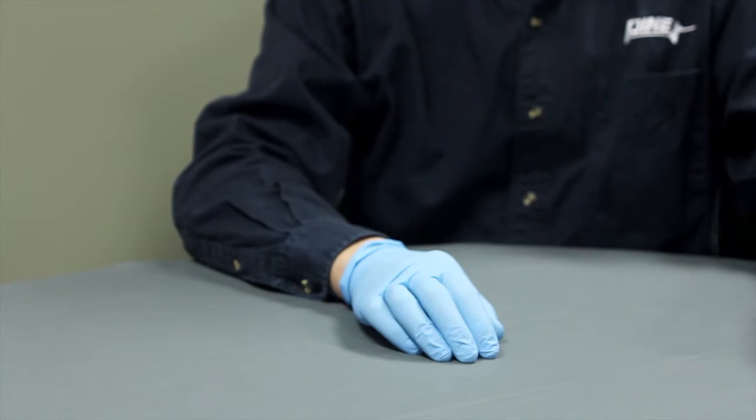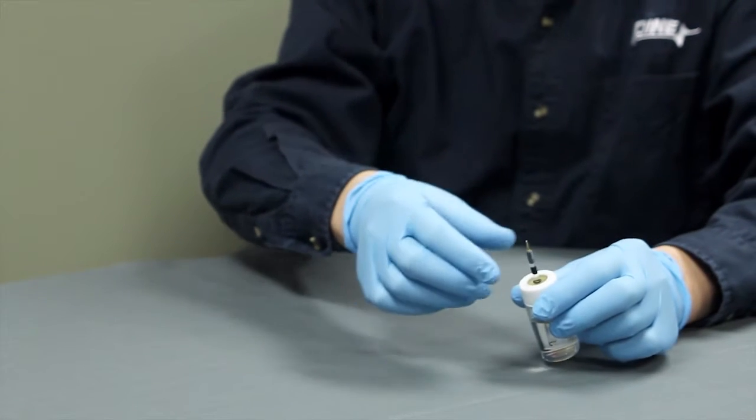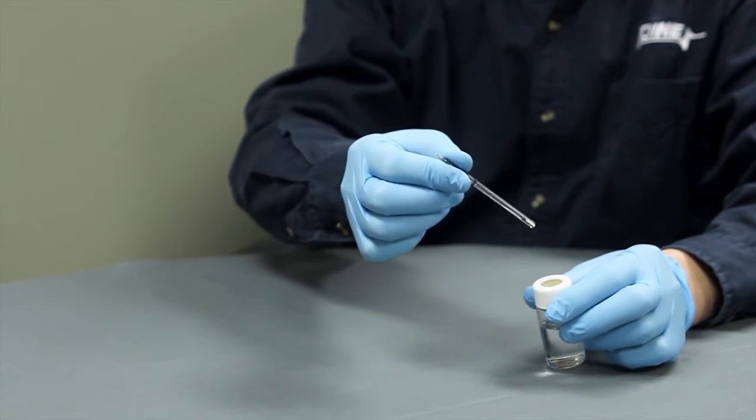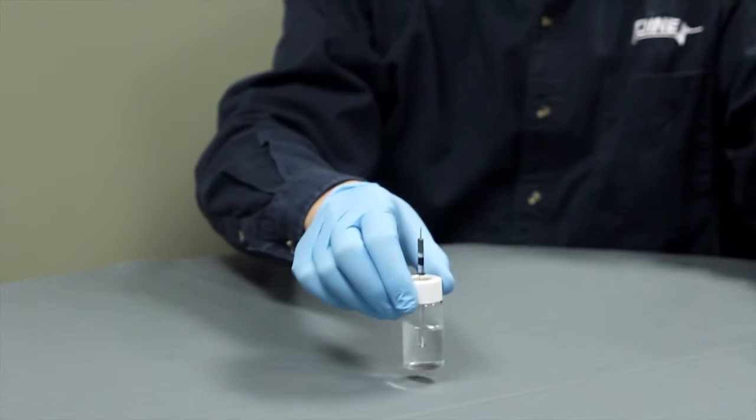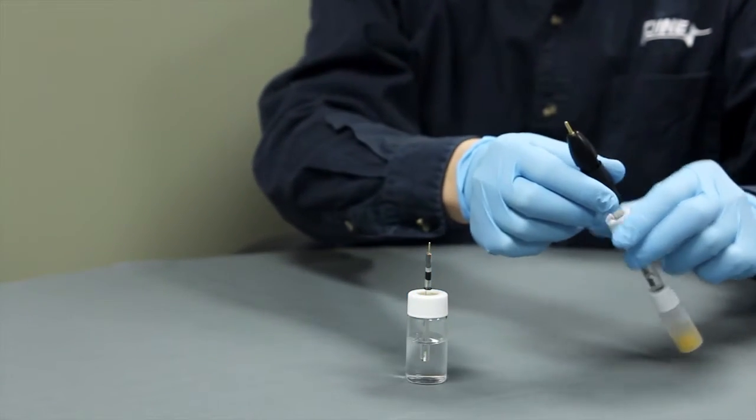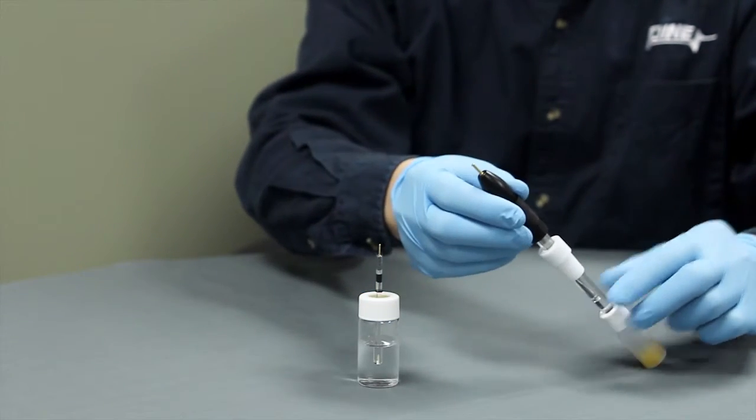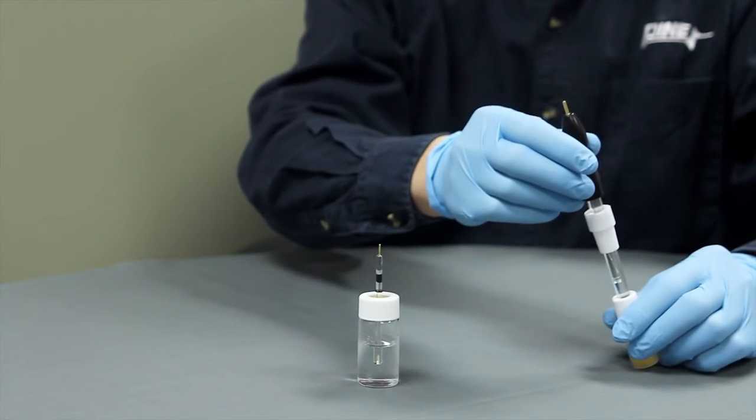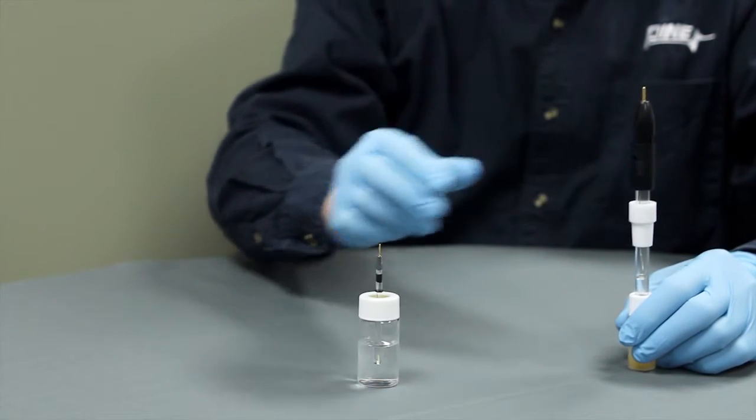Today we will talk about Pine's different reference electrodes. We have two sizes of reference electrodes. The first is our 3.43 millimeter diameter low-profile reference electrode. The second one, which is the one we will talk about in this video, is our standard 9.5 millimeter diameter reference electrode.